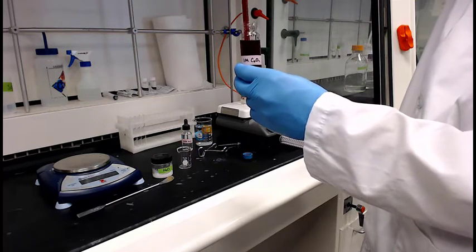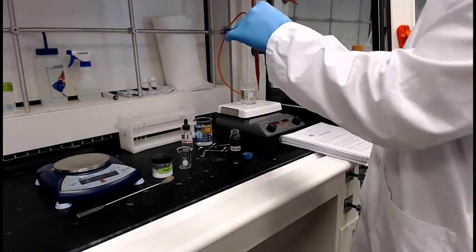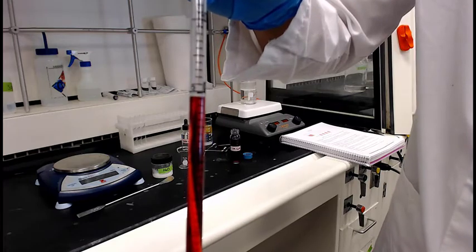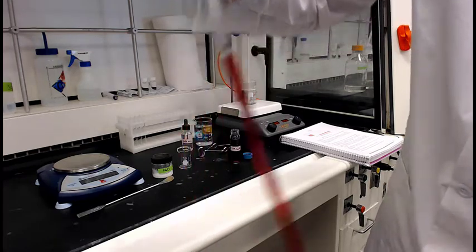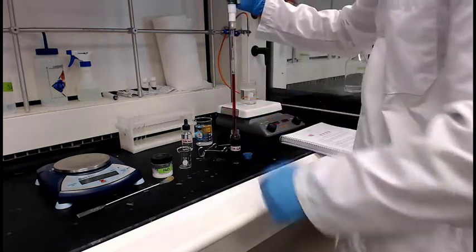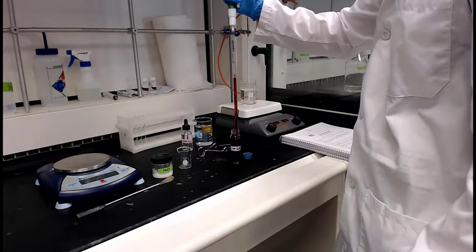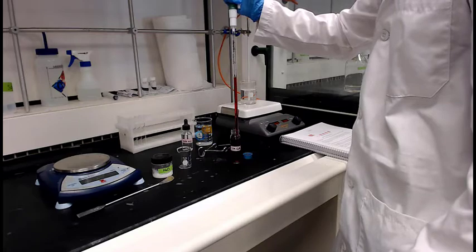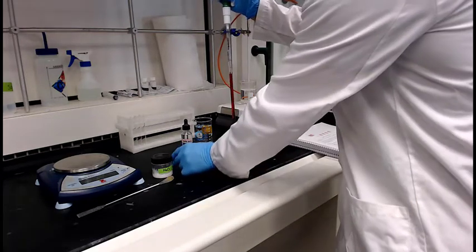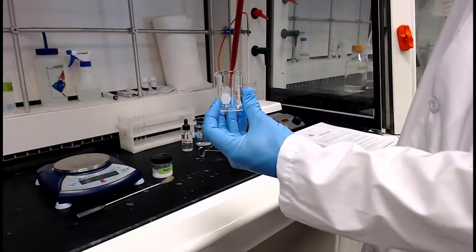So he uses a lot less detail in trying to clean out, pre-wash his volumetric pipette. These are fresh, they're brand new, and those are disposables. He's also going to dispense all the way out the tip, and again, you never do that if you're trying to set up a calibration curve. That's only in these kind of situations where you're just doing some qualitative work. I could have measured the 5 mil in a graduated cylinder, and that would have been close enough too. All right, so we get that into his beaker.